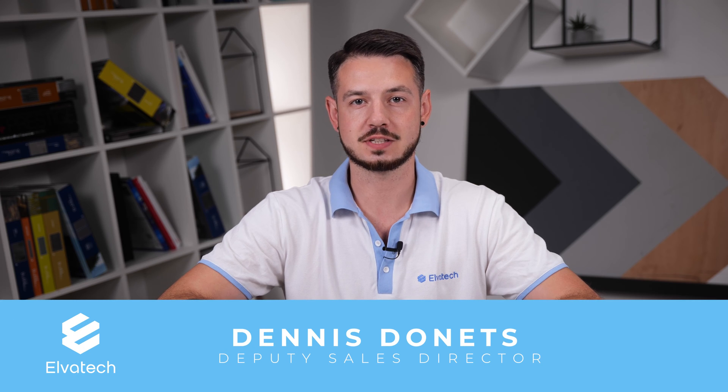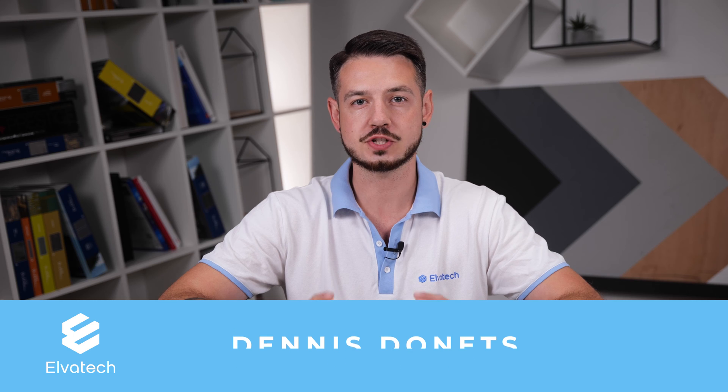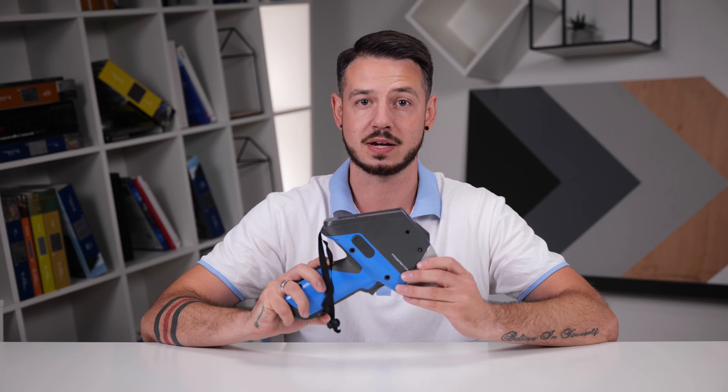Hello and welcome to Elvatex channel. Today we are going to tell you about the five most common mistakes that beginners often make while using portable XRF analyzers Prospector.